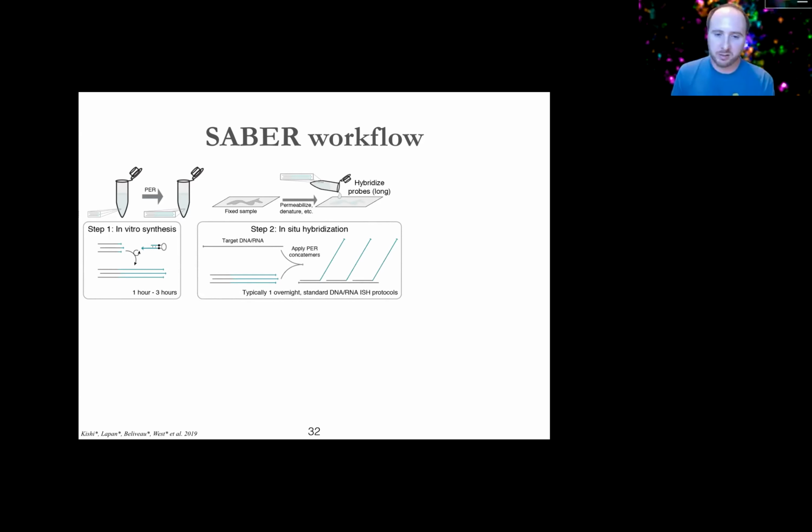You essentially can then just go ahead and do your in situ hybridization as normal. So you can hybridize PER extended FISH probe oligos, Oligopaints, using the same exact protocol as you would normally. You don't have to change anything. They seem to work fine as long as you don't make them too long. Or you can, again, hybridize probes that provide secondary oligo binding sites or bridge sites or readout sites. There's many different terms for this, but these single-strand overhangs can then be used to recruit a common sequence that's been extended in a separate PER reaction.